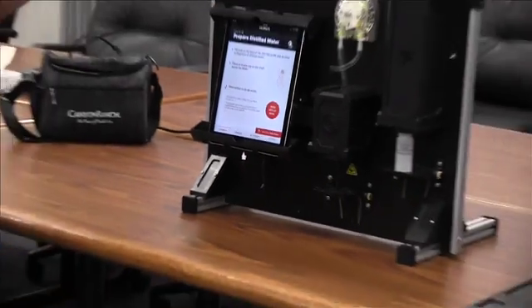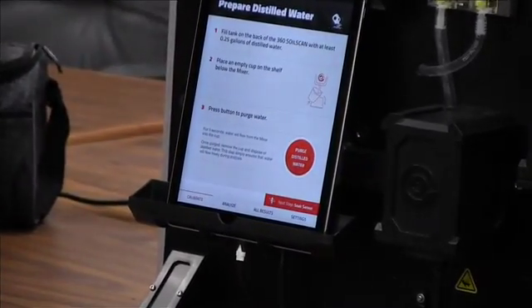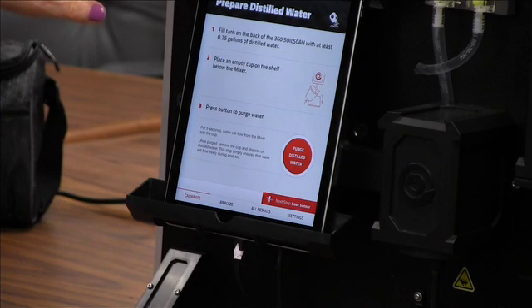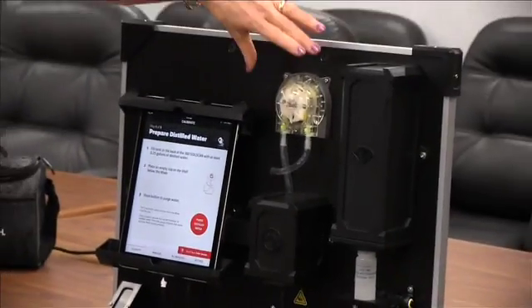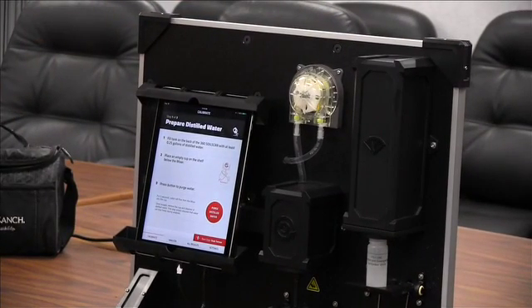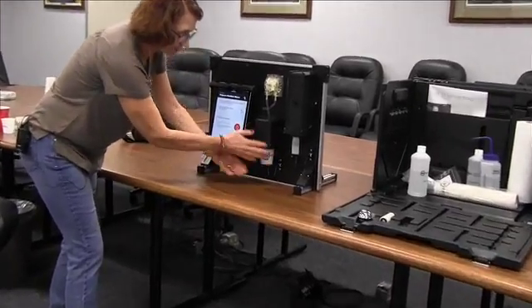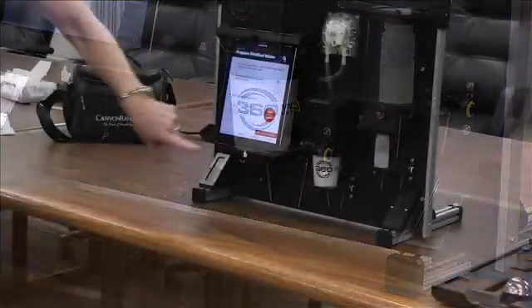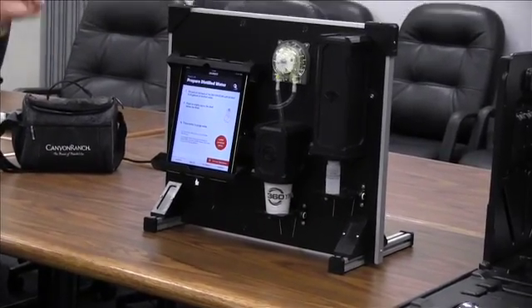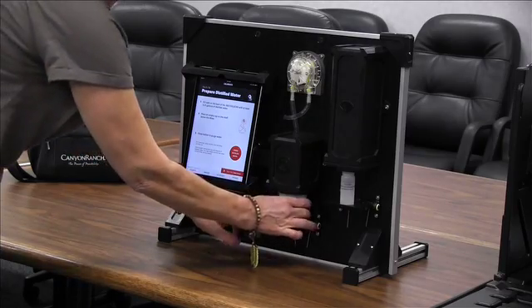The first thing it's going to want to do is purge the unit. Make sure you've got at least a quarter of a tank of distilled water. What the purge is doing is making sure there's enough distilled water in the unit so that when you start calibration it has the exact amount of water in the cup. Place the Dixie cup over the mixing unit and hit purge — it fills the cup to make sure there are no air pockets in the tubing. The unit is now purged.